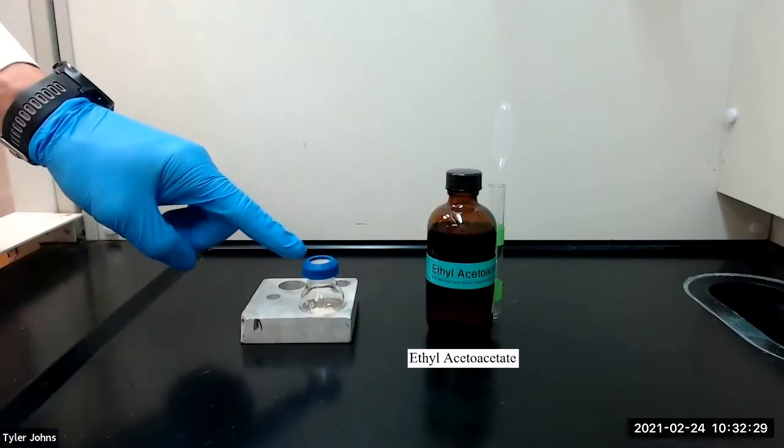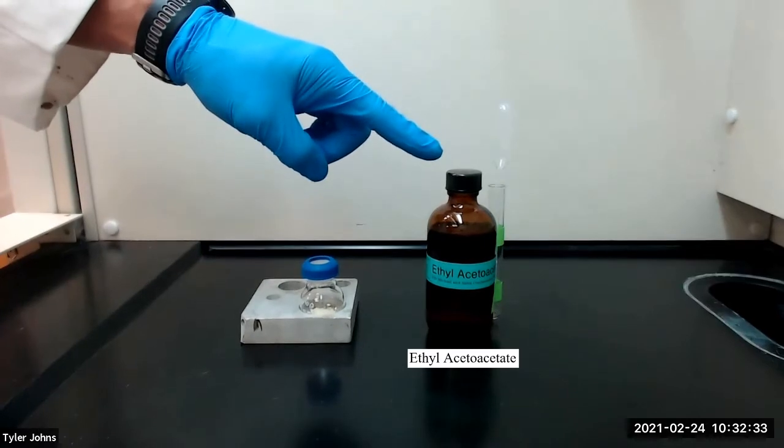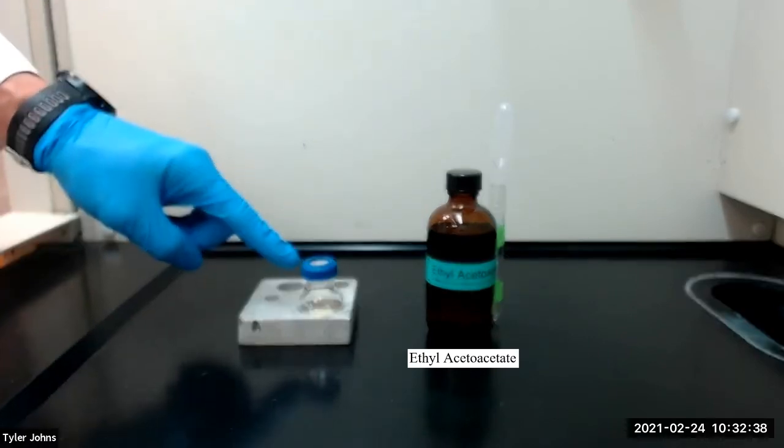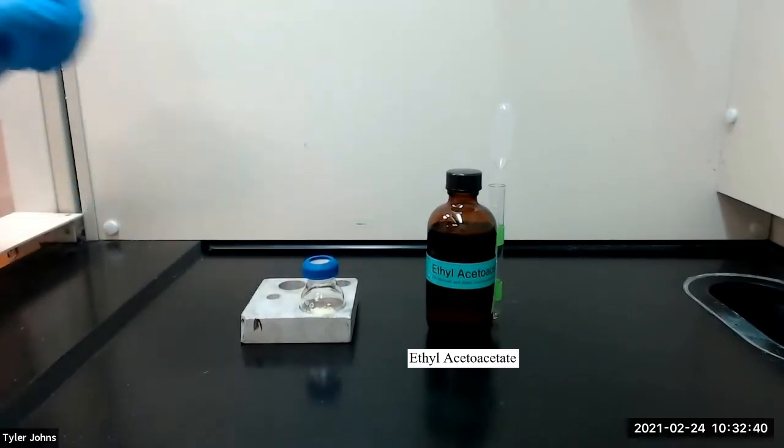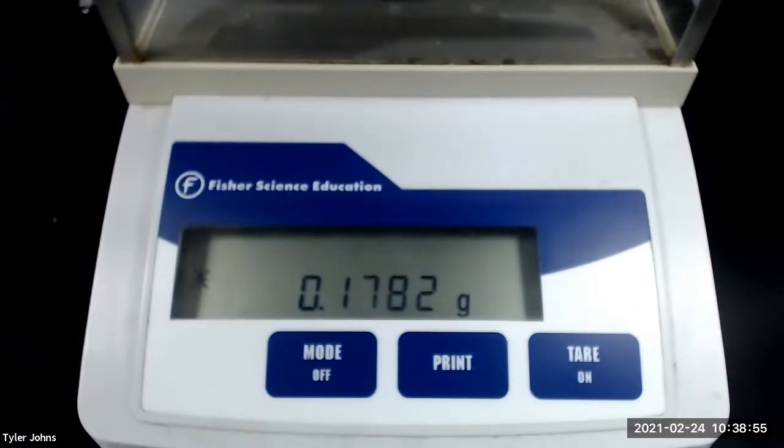I've added the trans chalcone to the 10 milliliter round bottom flask and we next need to add approximately 0.15 grams of ethyl acetoacetate to the same 10 milliliter round bottom flask. The mass of ethyl acetoacetate that we will be using is 0.1782 grams.